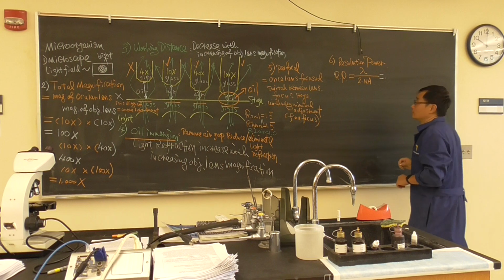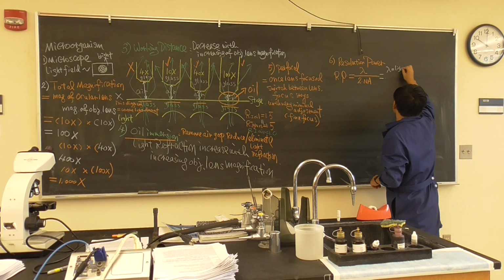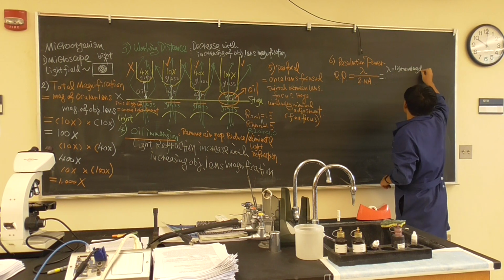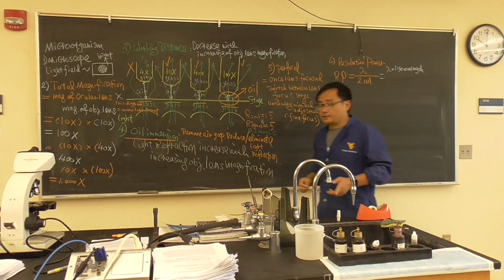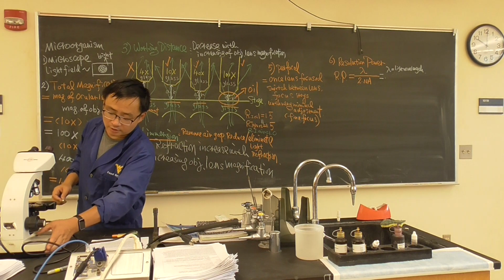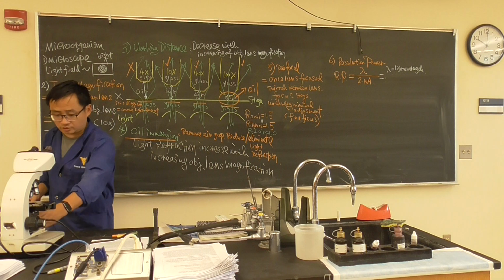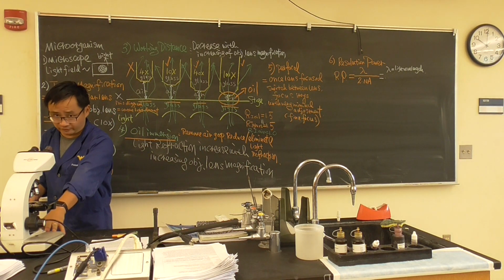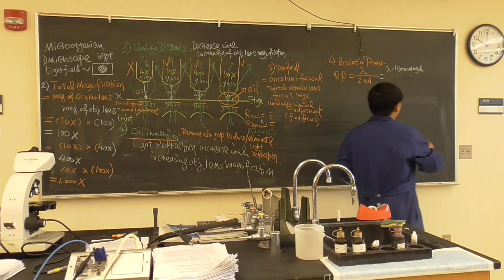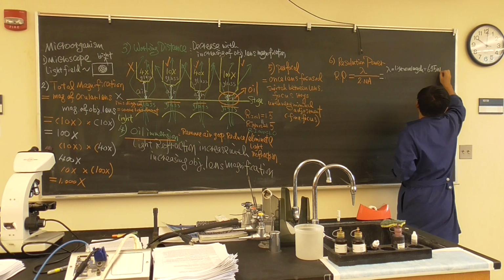What is lambda? Lambda equals light wavelength. Remember I said when you plug in the light, you go all the way to the bottom. That is the light wavelength. The light wavelength here is fixed. It equals 625 nanometer.